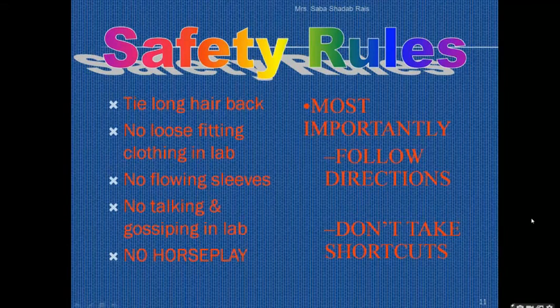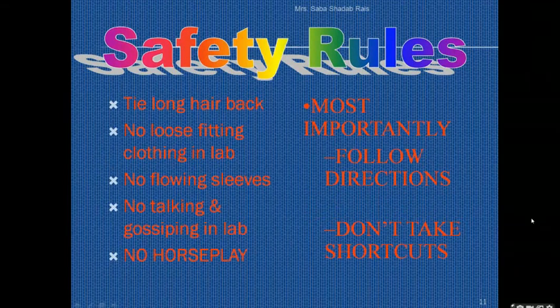Then volatile and inflammable chemicals should be kept covered and far from the source of fire when they are not in use. So whenever you are using any type of chemical, make it a simple habit to cover it. Most of the time students take out the beaker and keep it here and there. It should not be done. Care should be taken to prevent catching fire, because you don't know the nature of the chemical.